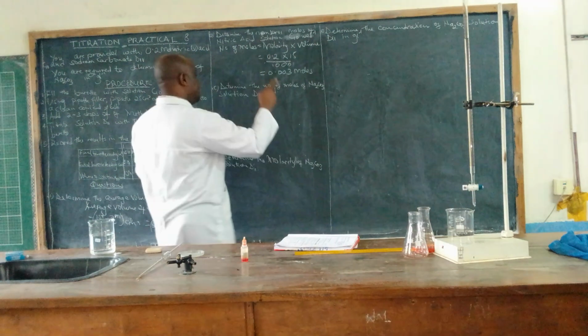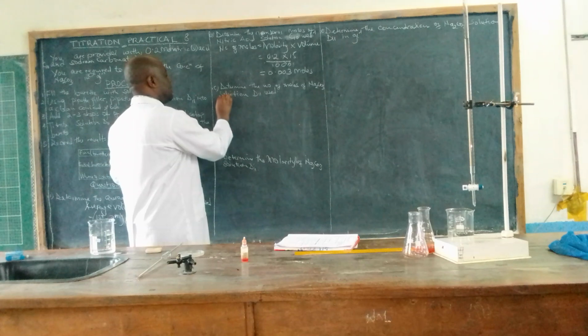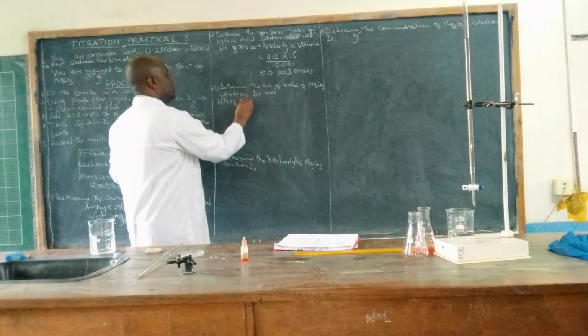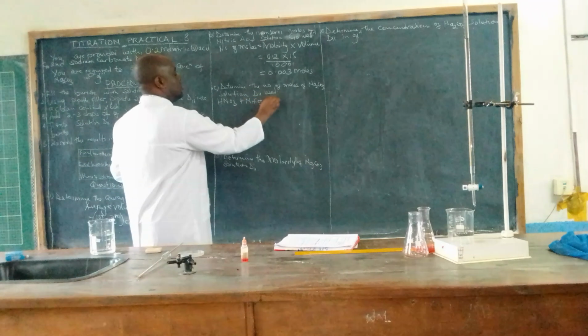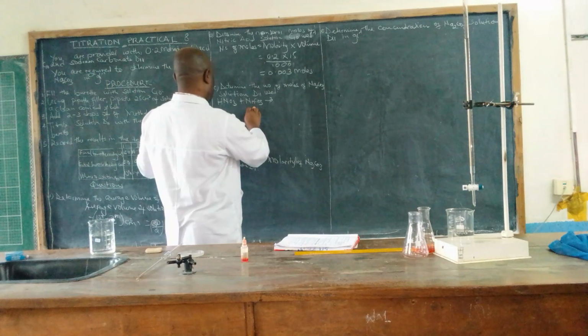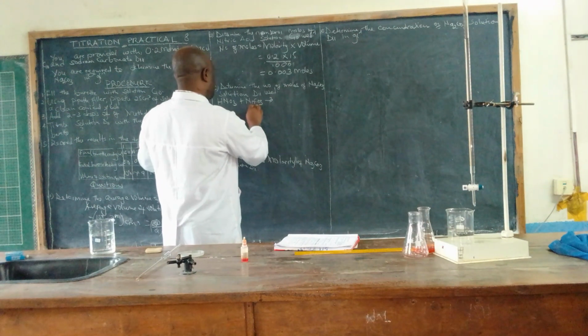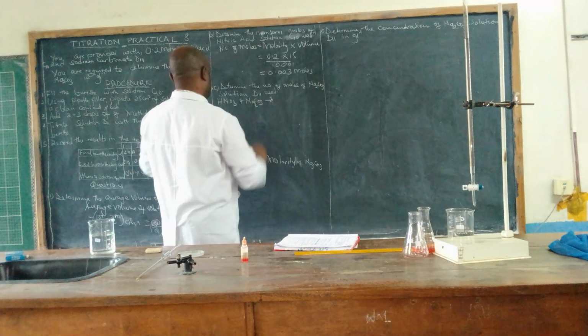So we are going to write an equation like that: nitric acid plus sodium carbonate, it's going to give us sodium.